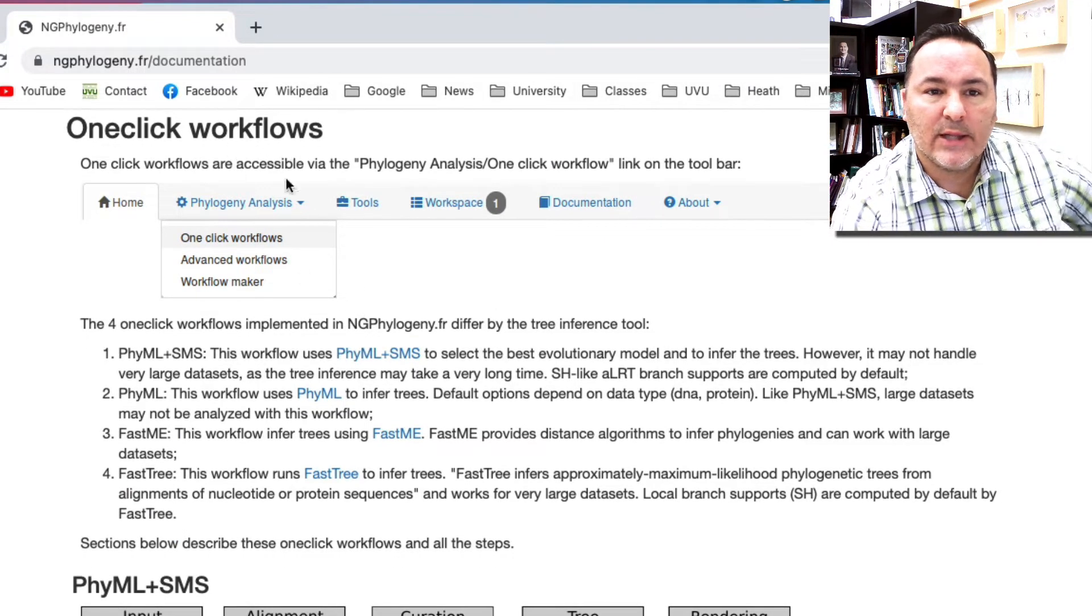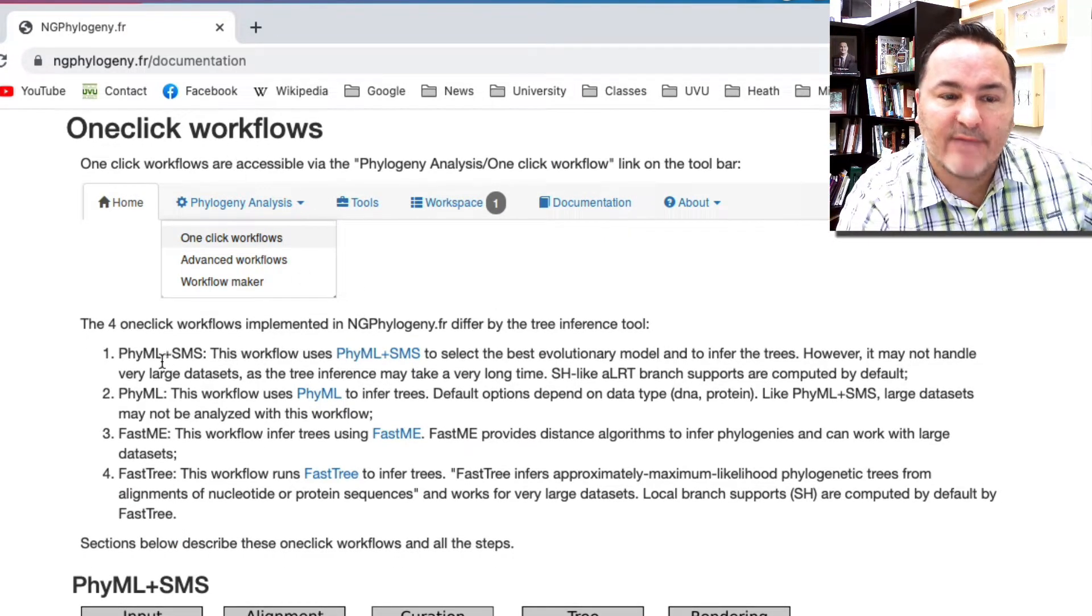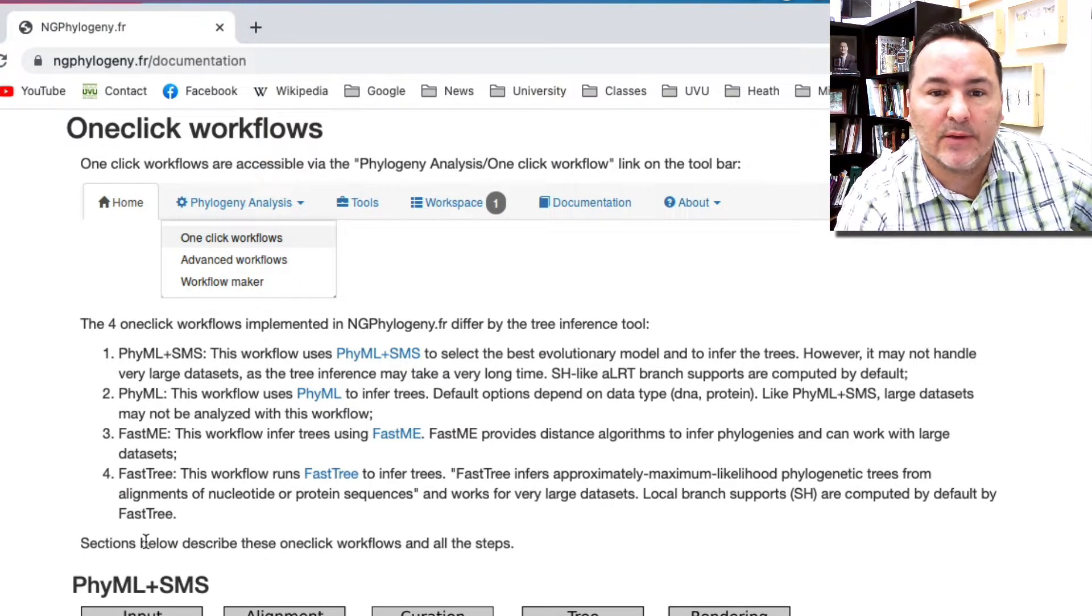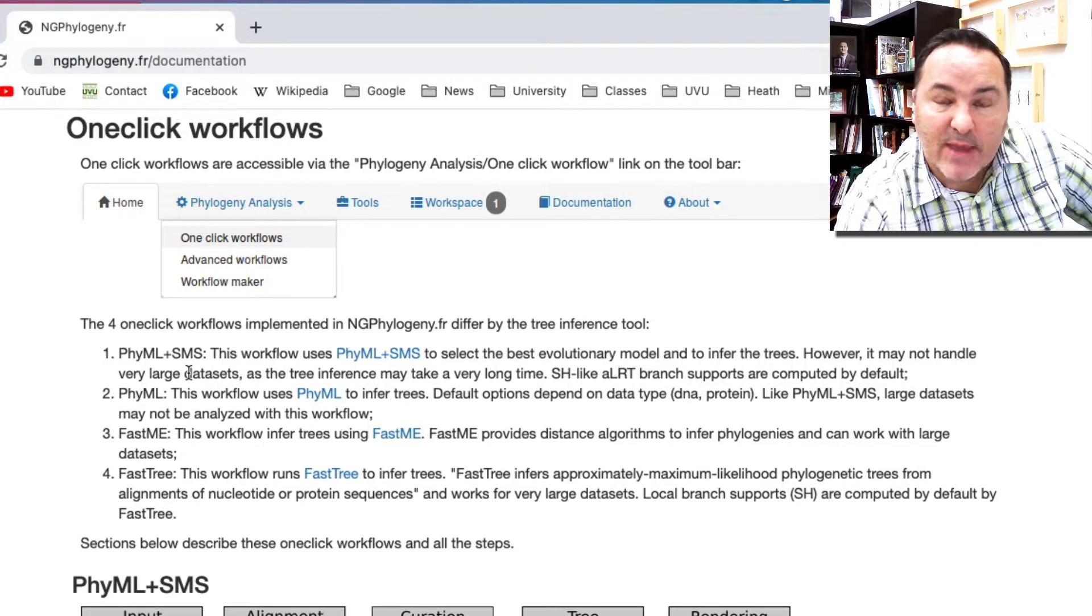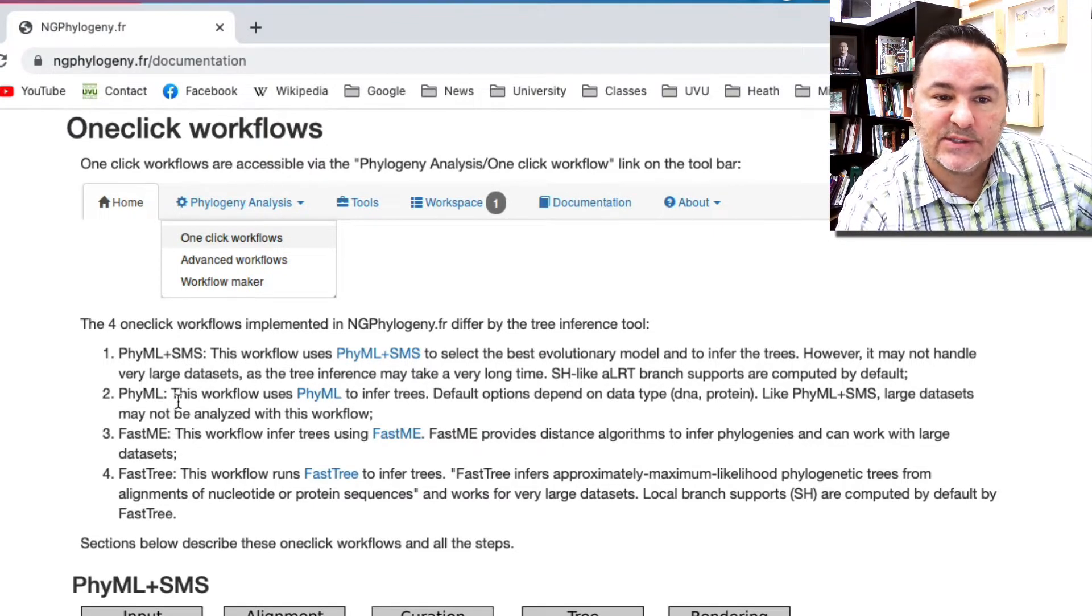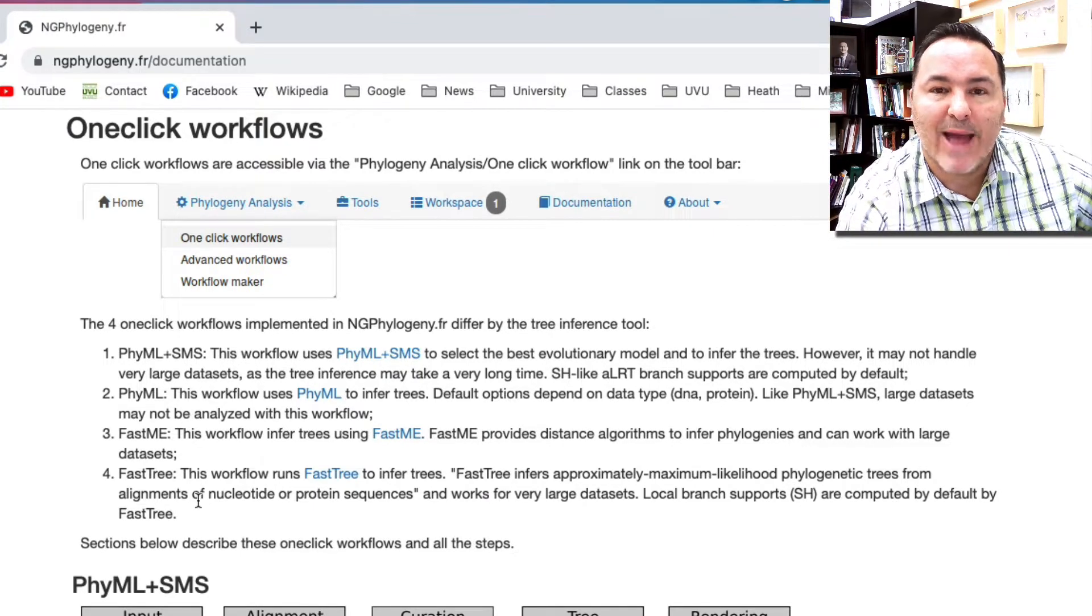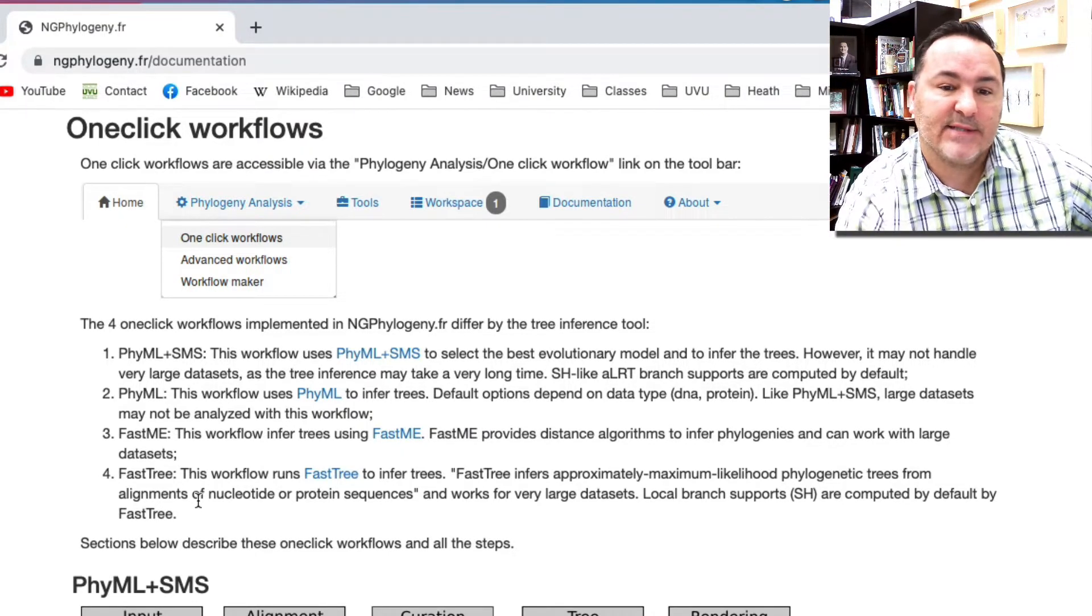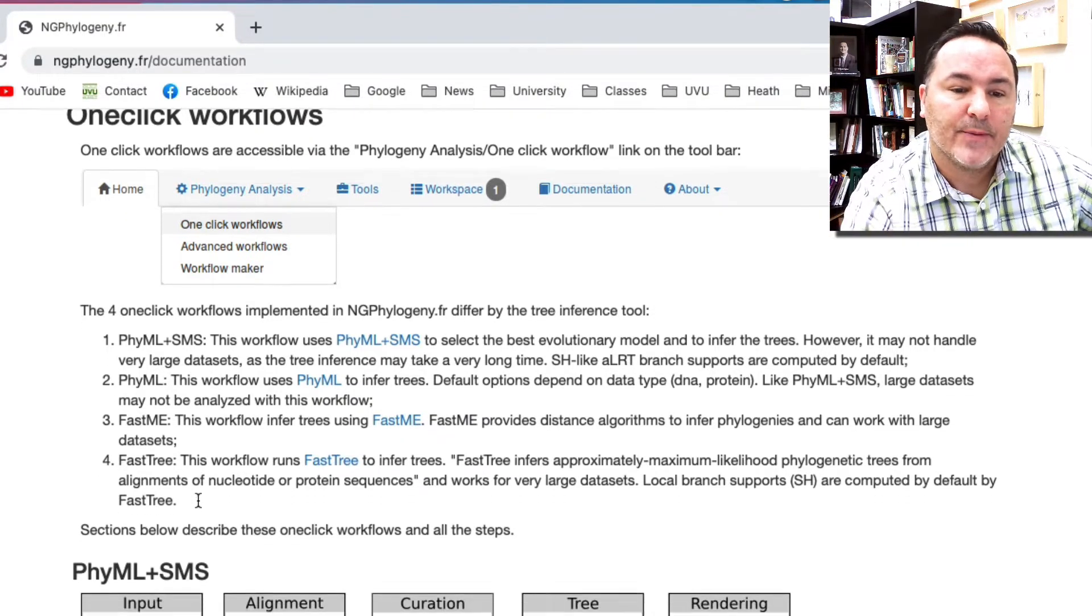In the one-click workflows, they have four options that are kind of pre-built. These may work for you. You could read through these to see whether these match the kinds of analyses and the size of the data set that you have.